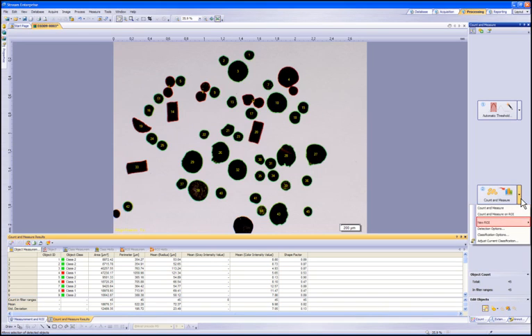Below this, you can define a new region of interest by drawing a rectangle, circle, or polygon. You can have multiple regions of interest to detect particles within. This will provide you with phase measurements of particles compared to area of the region of interest.